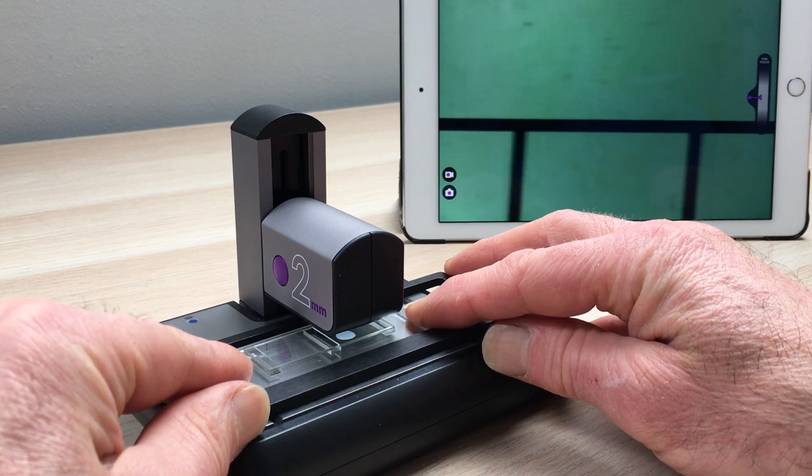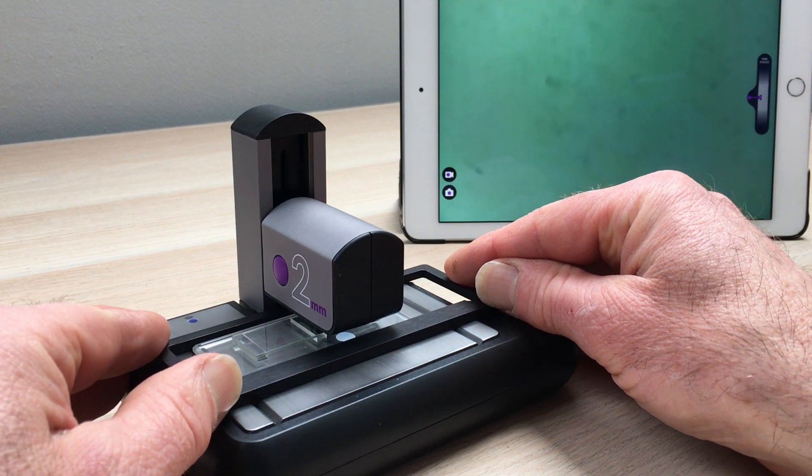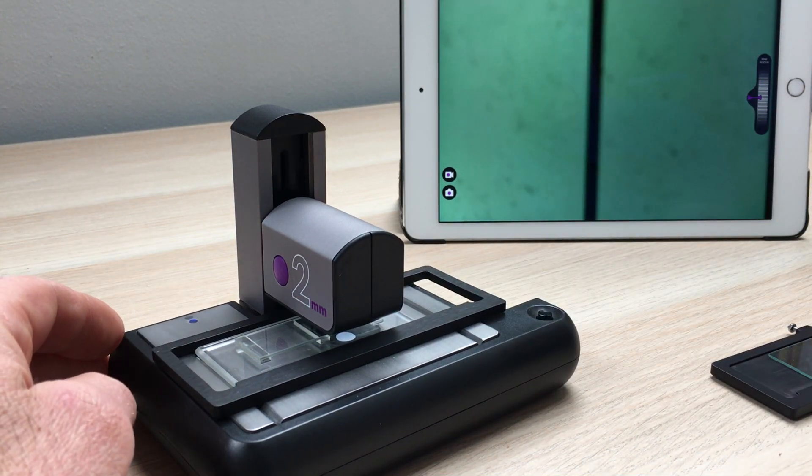We can then move to the next set of lines this way and count up and down there. It's very simple, it's very robust. If you'd like to buy one of these you can get them from our website iLite.co.uk. Thanks very much.